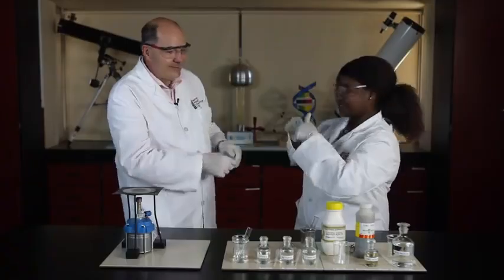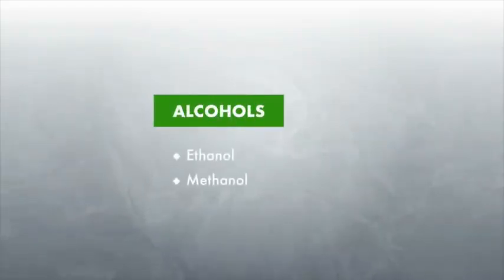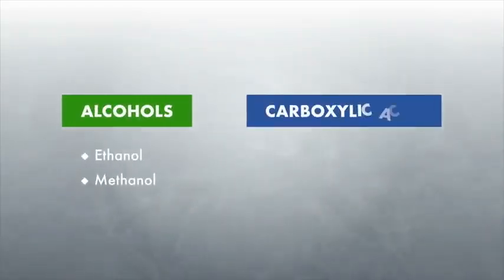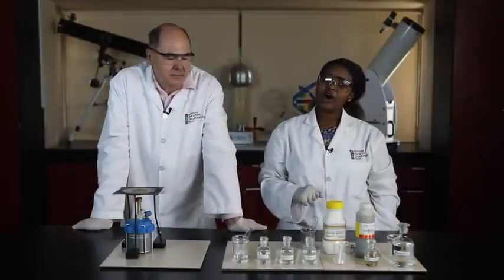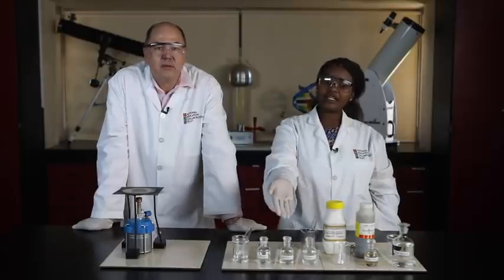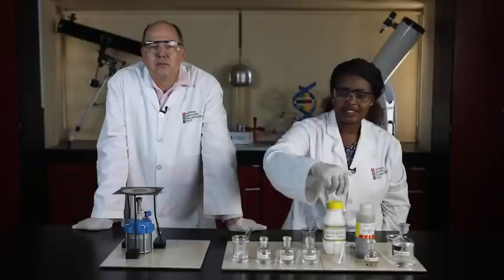Today we use ethanol and methanol as our alcohols and ethanoic acid and salicylic acid as our carboxylic acids. As you can see, all of these substances are liquid except for salicylic acid, which is a crystalline solid.